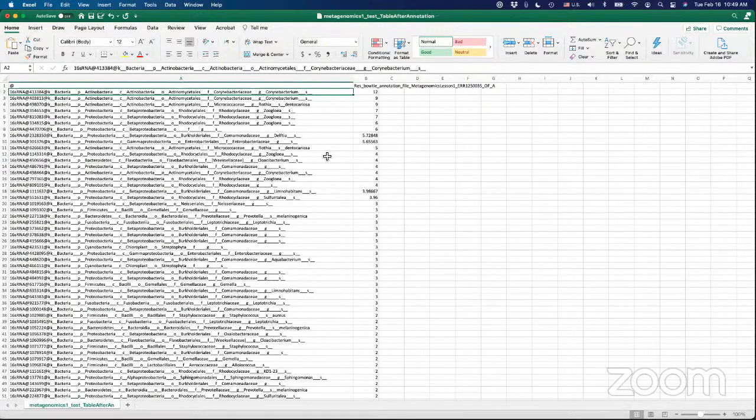In this way, we can start thinking about what kinds of bacteria are likely to be present in the sample, and how we understand the impact of such bacteria on the phenotype, which is described by metadata.